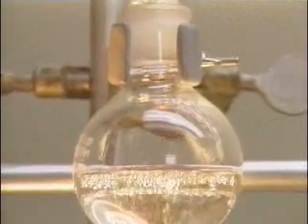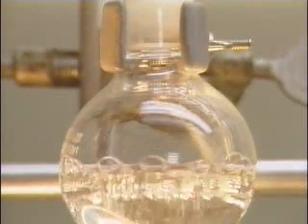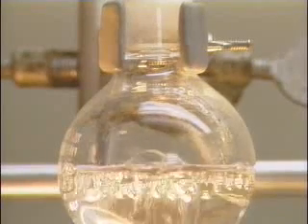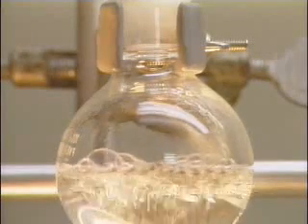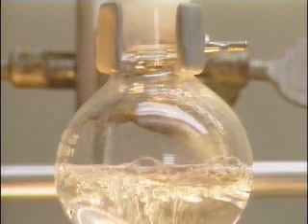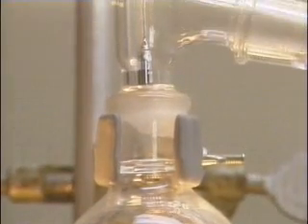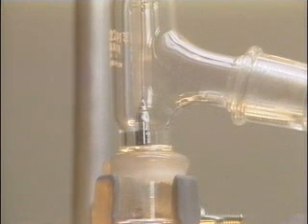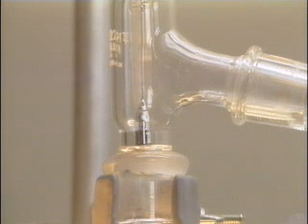As the liquid begins to boil, the hot vapors rise up the sides of the flask and into the distillation head. As they reach cooler portions of the apparatus, the vapors condense and return to the flask. They also heat up the apparatus so that the next portion of vapors rises higher than the preceding portion. Eventually, all of the apparatus is warm and the hot vapors pass over the thermometer bulb.